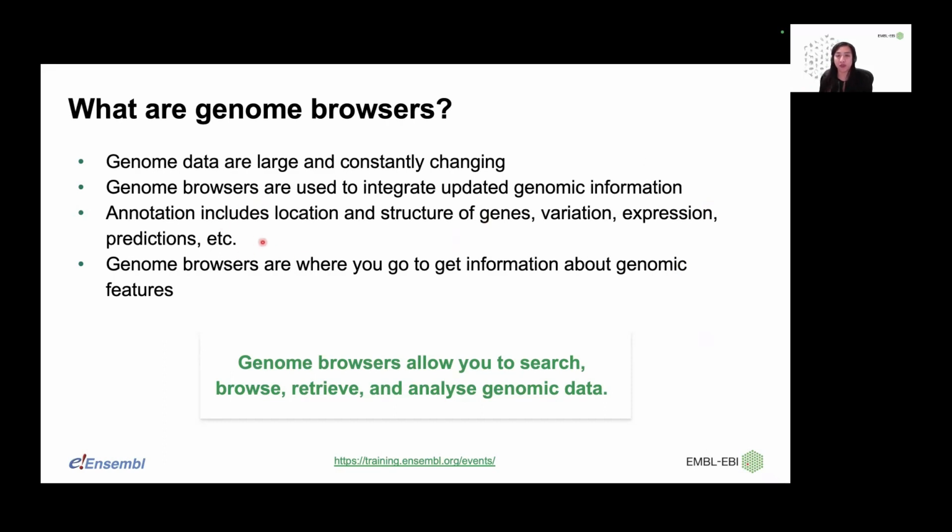So genome browsers provide annotation. This includes genes, genetic variants, regulatory data, and so on. But what genome browsers are especially useful for is to get information about genomic features. So genome browsers allow you to search, browse, retrieve, and analyze genomic data.